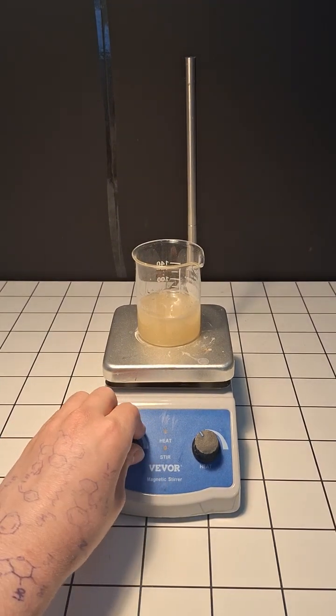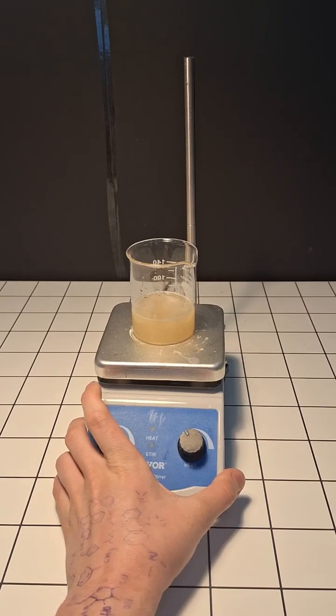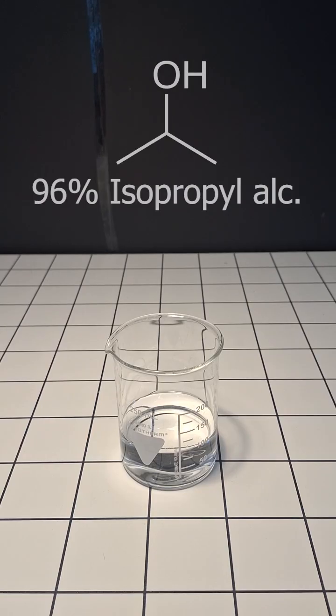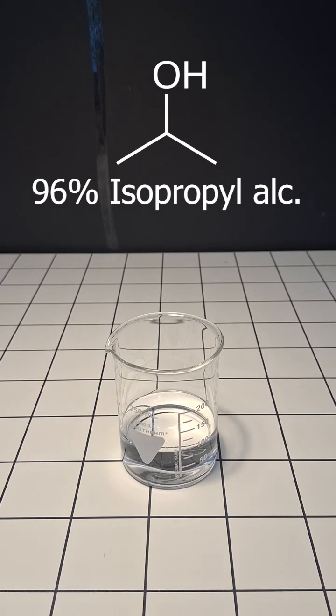At this point, the solution should be ready, and we can now move this to the side. The next thing that we're going to need is 100 mils of 96% isopropanol.